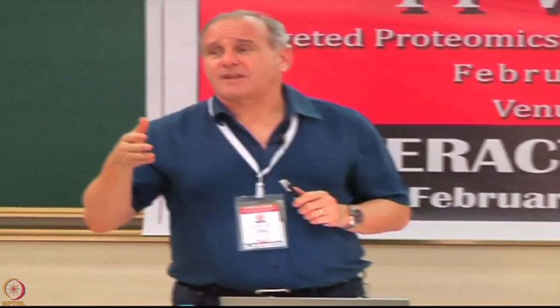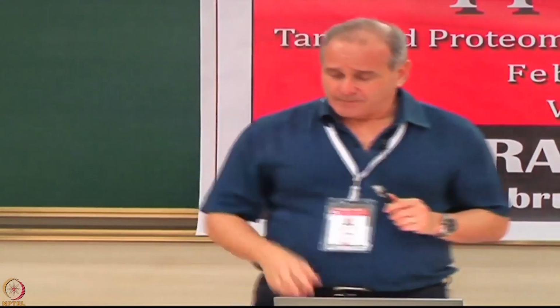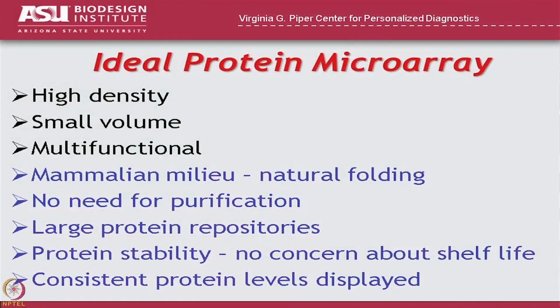And the longer it sits there, the more likely it is to stop being active or being well folded. All right, so, and of course, you want the levels of protein from one to the other to be very consistent. Those are the things that you'd really like.